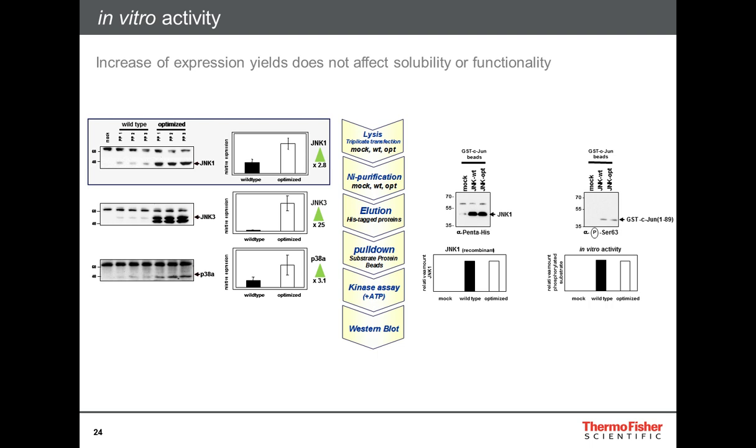However, of course, you can argue if a protein is expressed really high, then maybe it lacks the time for proper folding and may lead to a larger proportion of non-functional protein.